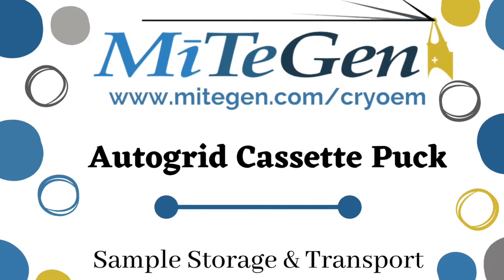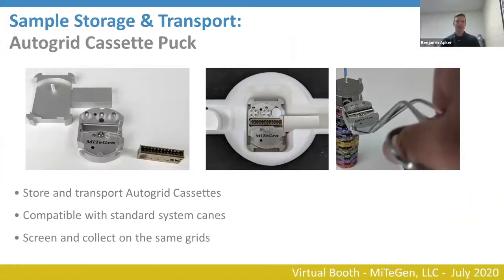The next step for us is a product we're bringing online soon: an autogrid cassette puck. The pipeline for sample collection is that typically you put them in cryo grid boxes, screen them, then if you had good samples you would take a similar sample, clip it, and place it into an autogrid cassette. This allows you to ship and transport your autogrid cassettes like you would a standard puck with cryo grid boxes.